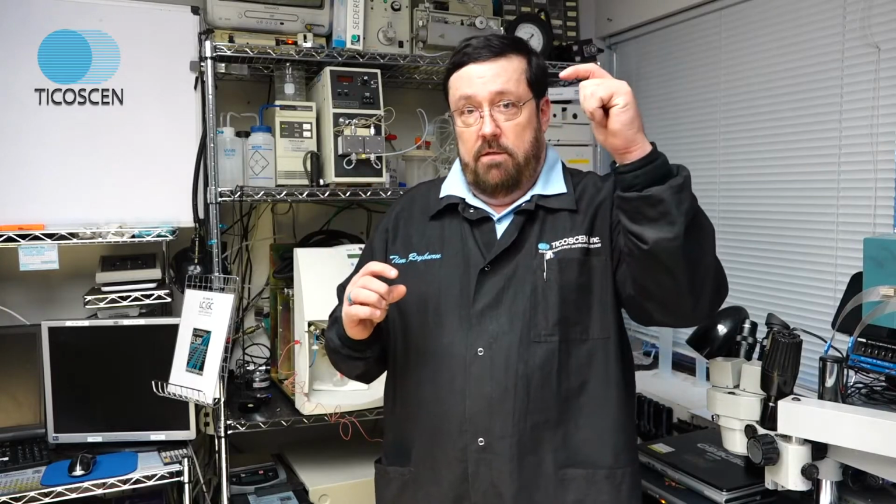You can program the PMT to run at gain 8 for the first peak to keep it on scale, then switch the gain to gain 12 automatically before the second peak comes out, and then that peak will have a very large response. Except you'll know the first peak was done at gain 8, the second peak was done at gain 12, so when you get your peak report, you just divide your peak areas by 4 times to normalize your areas to each other. And in one run, get relative concentrations and meet your LODs and LOQs with one run, with very different concentrations.